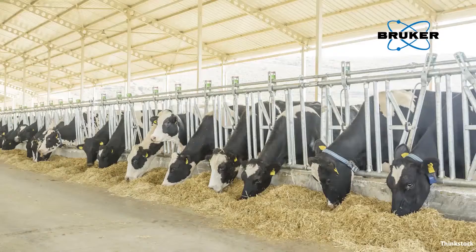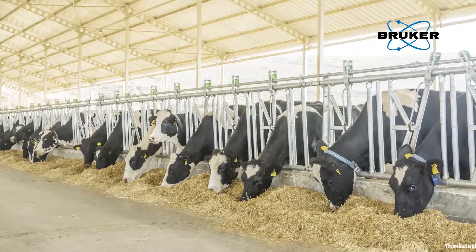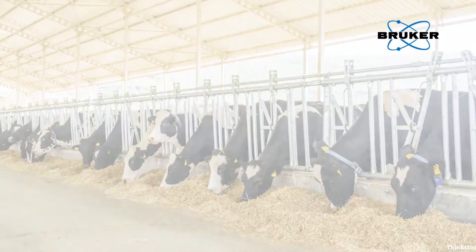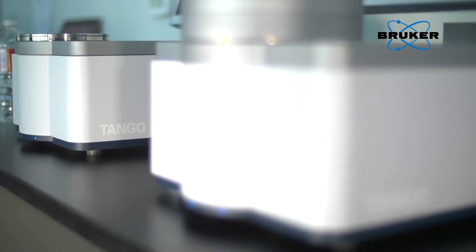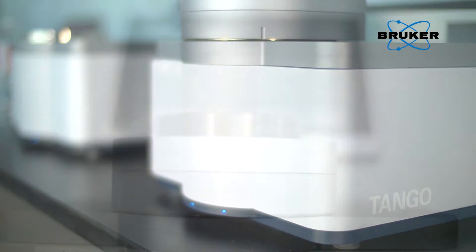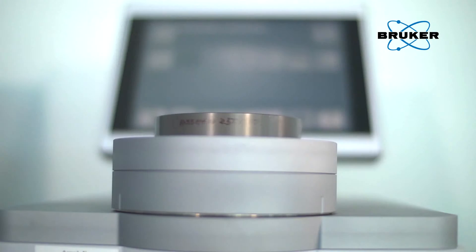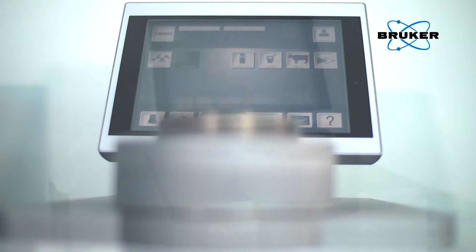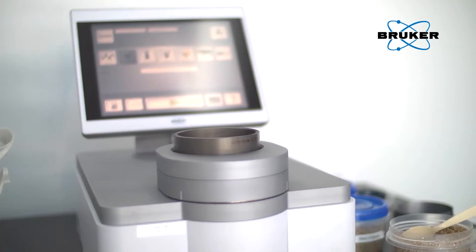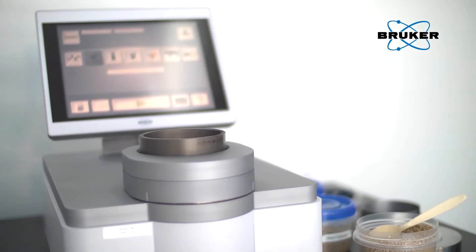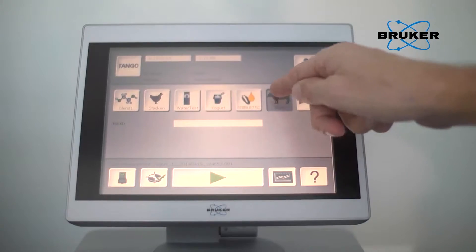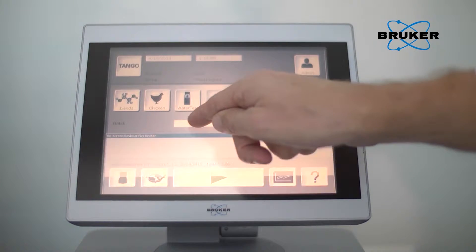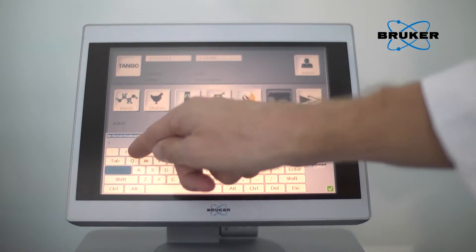Faster, simpler, more secure — with the Tango, your NIR analysis speeds up. The Tango has exactly what users require of an FT-NIR spectrometer suitable for industrial use: robustness, high precision, and straightforward operator guidance.